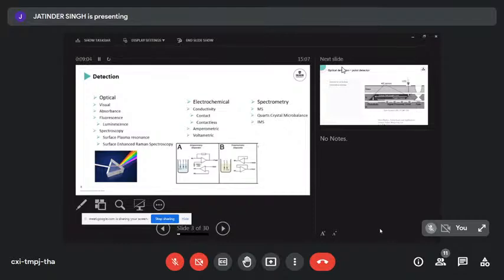You need to put in a little bit of excitation light, and then you get a whole load of emission light at another wavelength. Really nice. A little bit more funky, but good for our chemists, is luminescence. You may have a reagent that in contact with your analyte produces light, in presence of an electrochemical reaction, and we go electrochemiluminescence. Too complex for me, but a lot of people love it.